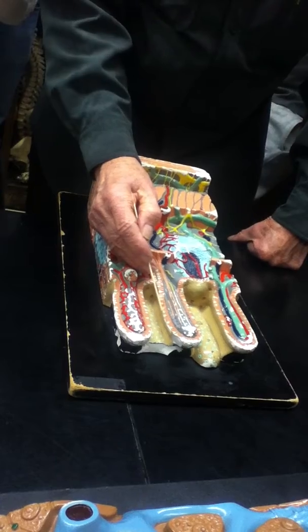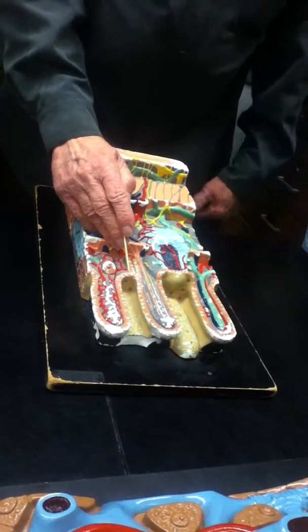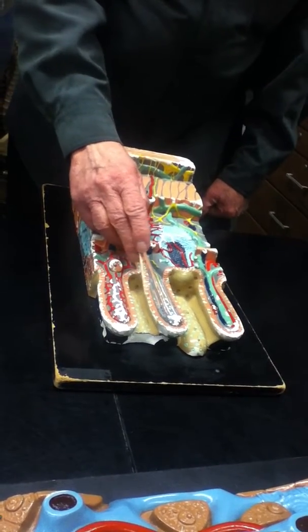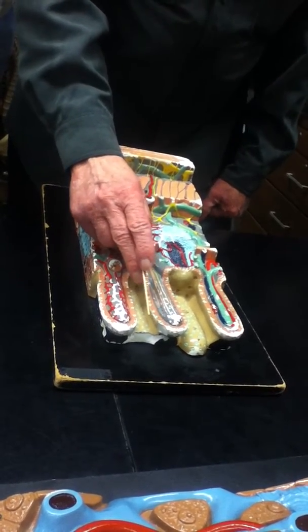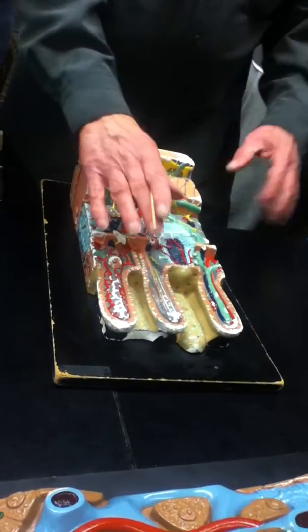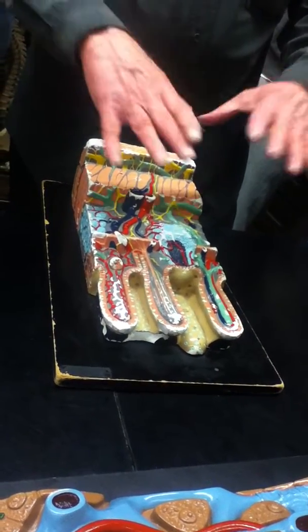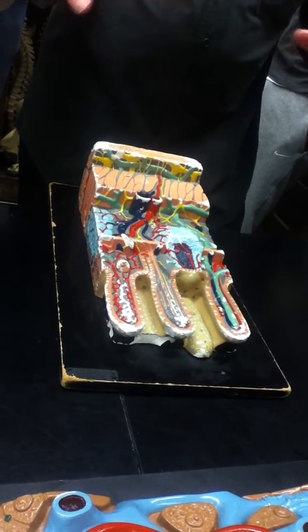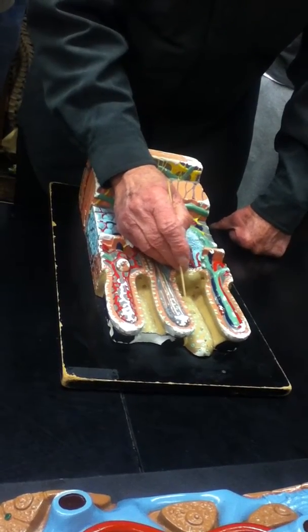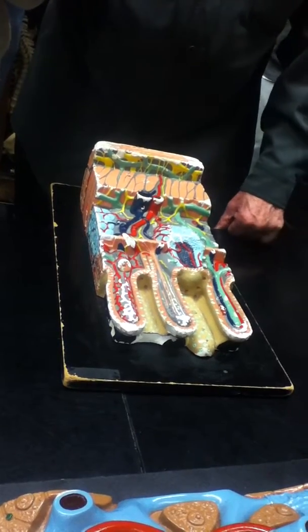So these blue jobs, if I label the blue thing over here, you've got to tell me goblet cell or mucus gland cell. And these are columnar epithelial cells. Although you don't see it here, because this isn't blown up enough, if you magnified it even more, microscopically, you would see that the open ends of these columnar epithelial cells have microvilli.